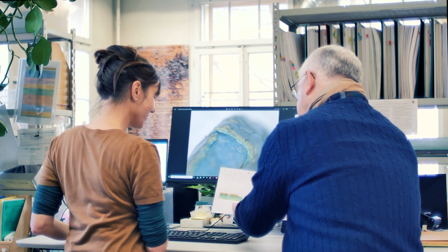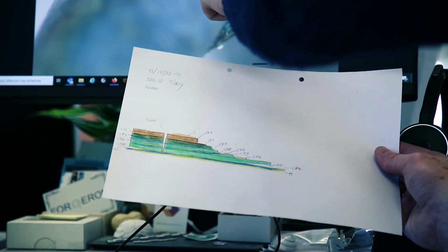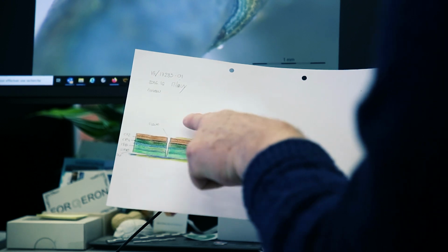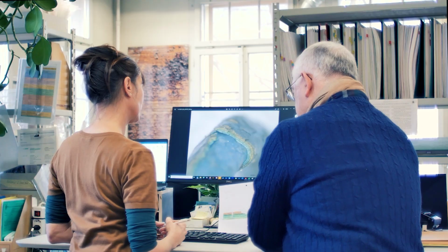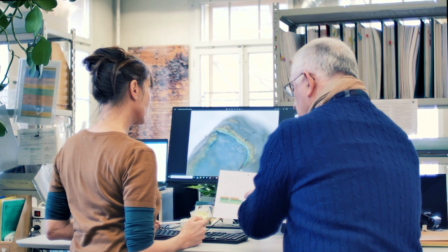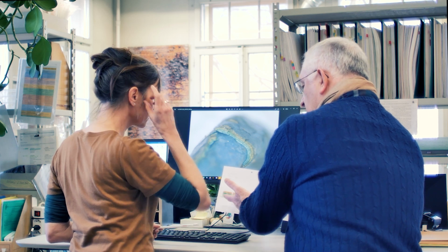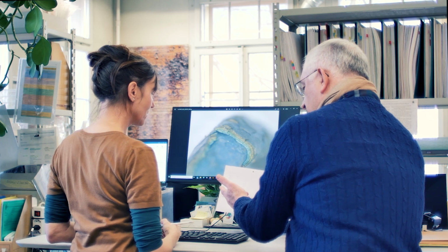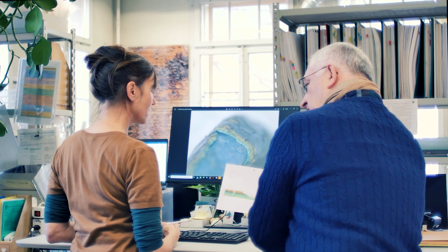It's quite complicated stratigraphy, and this might be quite representative of what we have on the whole object, cracking going through the whole structure. The system is not able to study this stratigraphy that we made by drawing. So we have now to transform this stratigraphy in a digital representation.